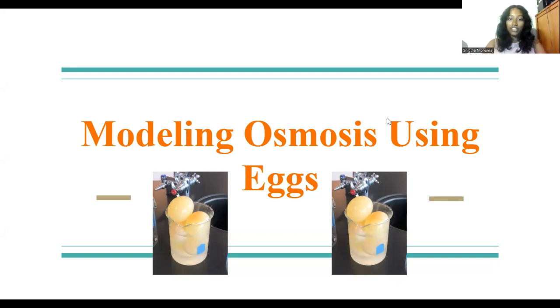And I recently took AP Biology and found one of the labs that we did very cool, very simple. It was definitely great as a learning tool for the topics that we were covering within that class. So if you're interested in biology or just wanting to do a fun lab just to get the hang of doing these labs and experiments on your own, this is a very simple project for you to do, and it's definitely loads of fun. And so, like the title says, as you can see, it was about modeling osmosis using eggs. There are definitely other materials that you can use that aren't eggs.